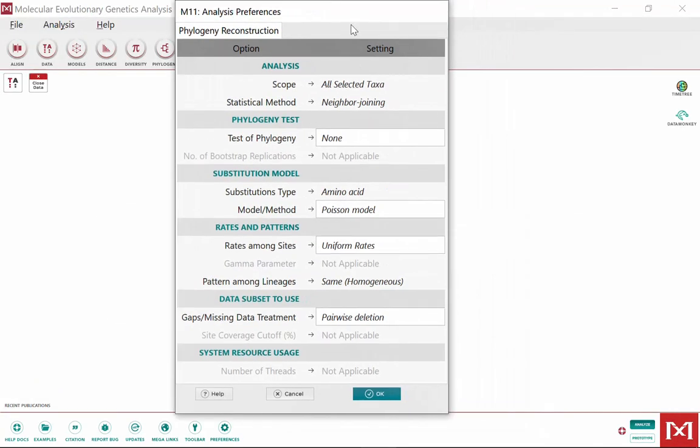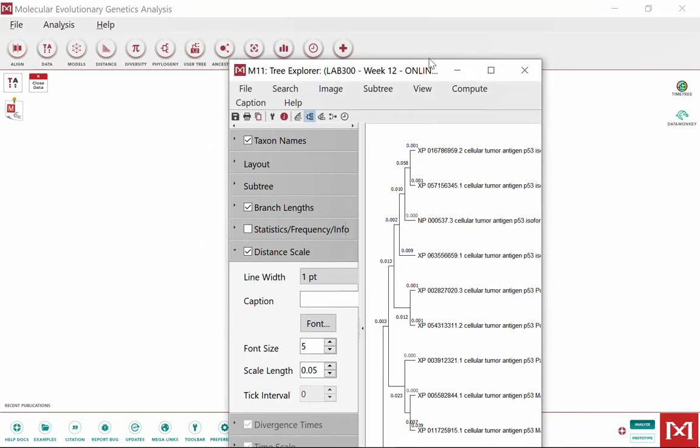Now it's going to ask you if you want to change any of these parameters here. Don't do it as we said before. You can play around if you want. Many things are in there. Again, this goes beyond the scope of this lab. All we want to see is really how you can use these sequences to generate these phylogenetic trees. And so press OK here, and it's going to give you ultimately the phylogenetic trees.